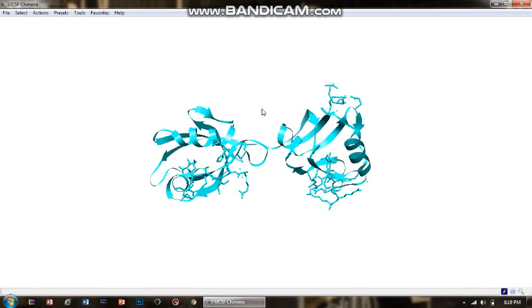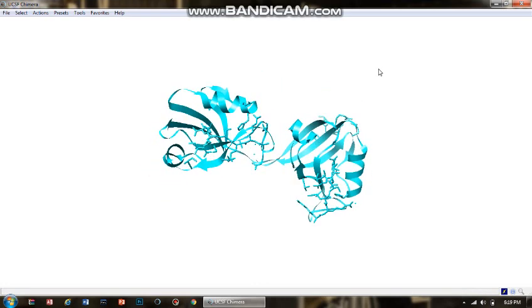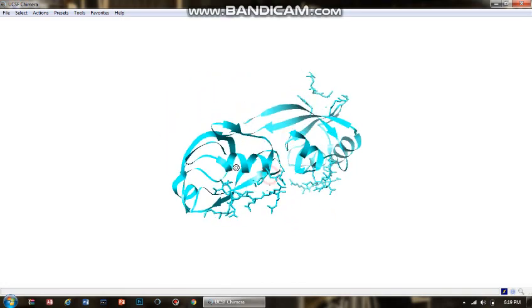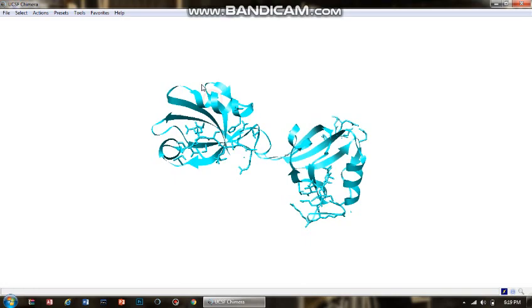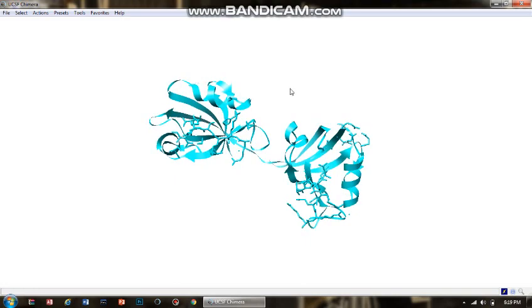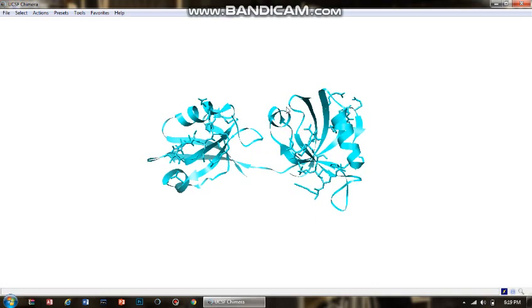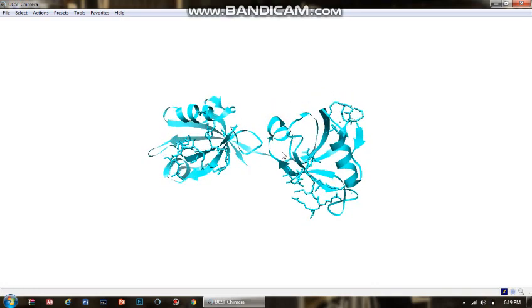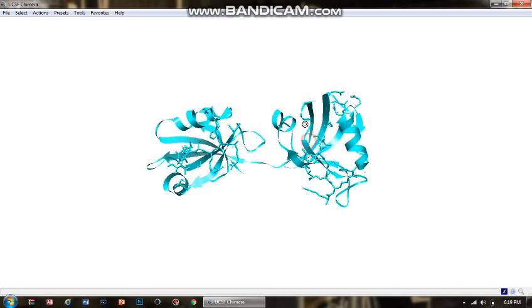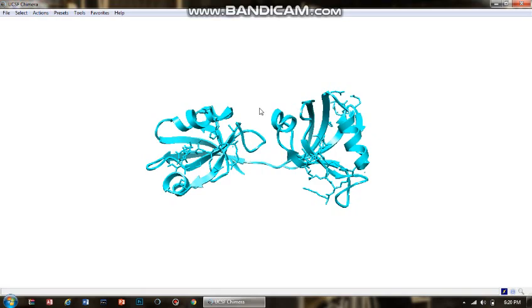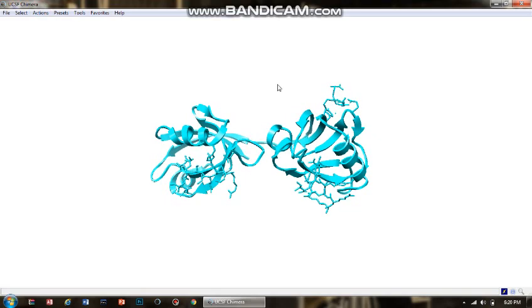This is the flat ribbon representation. As you can see, it is only focusing on the overall width of the molecule — there is no focus on the height. It is just extending in terms of its width.